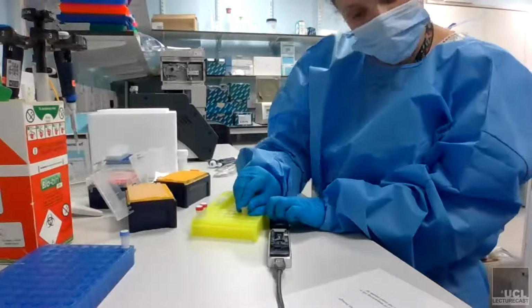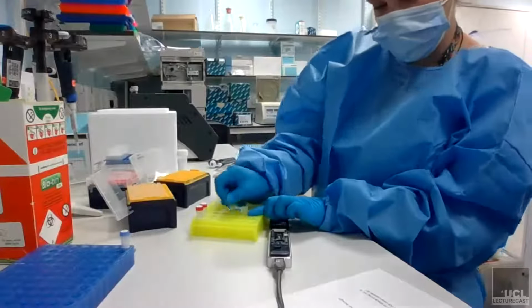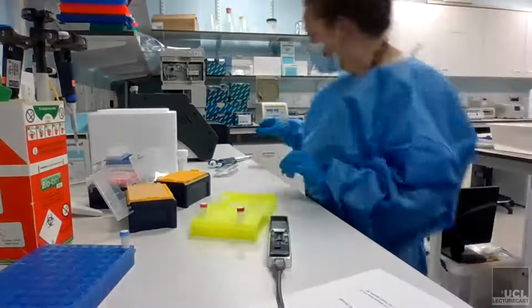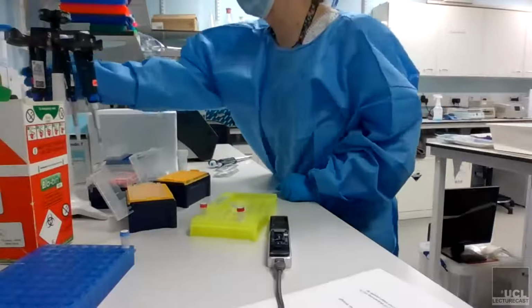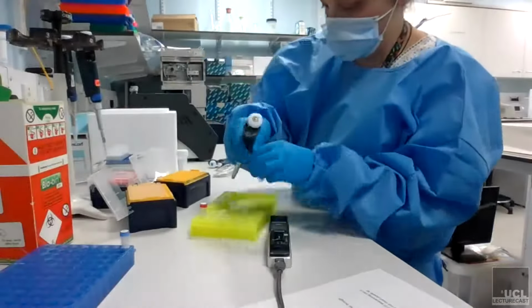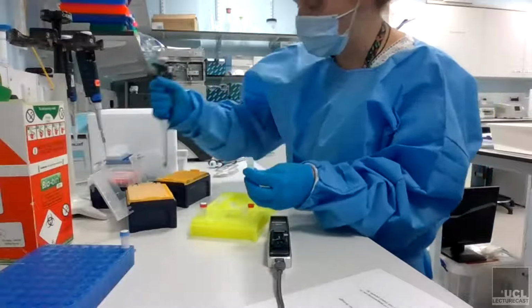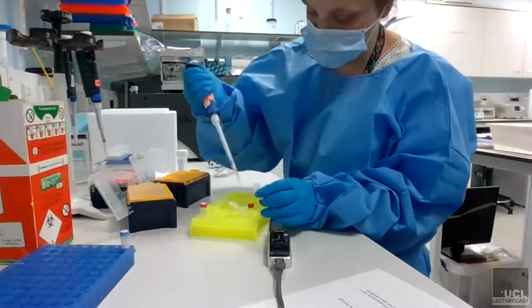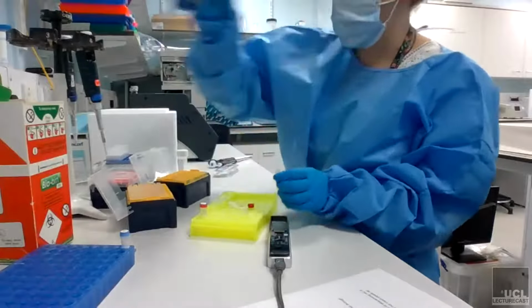So we've got our pool of our DNA library. I need to add 34 microliters of the sequencing buffer. 34. This is just a liquid, so you just need to mix it and then spin it down. So 34 of that.